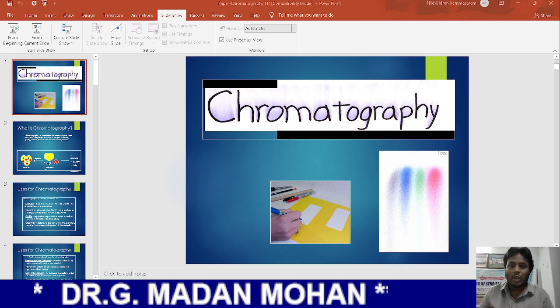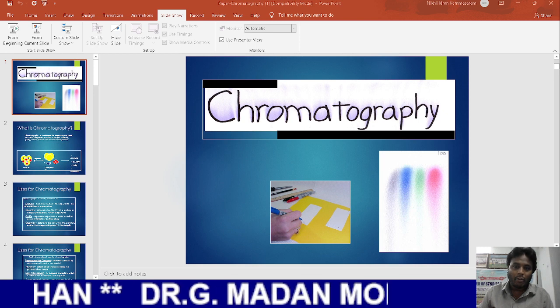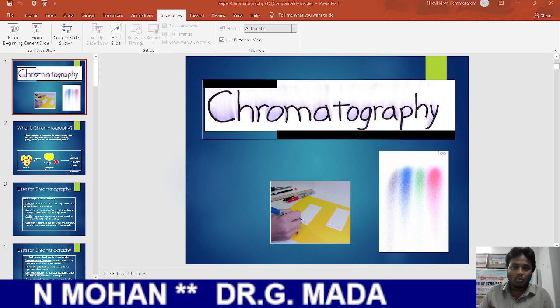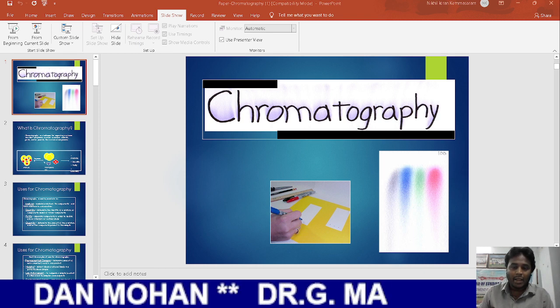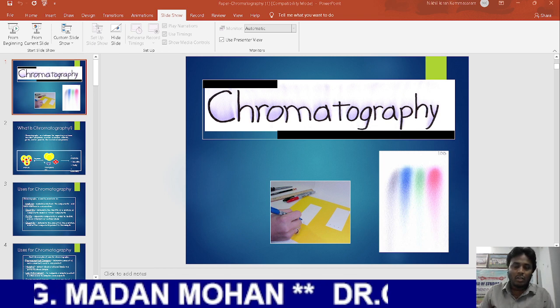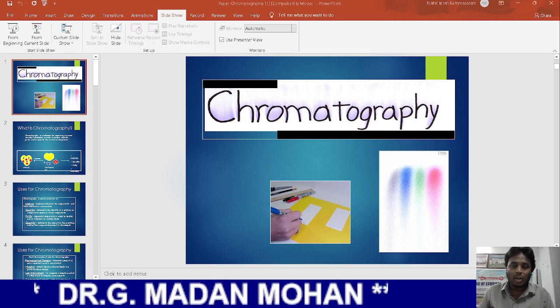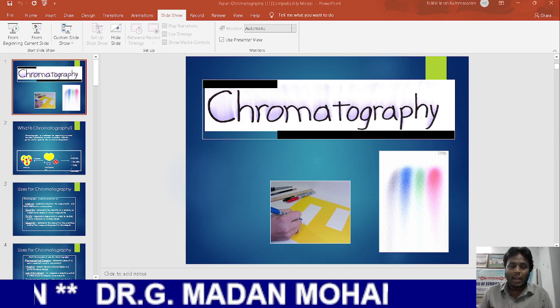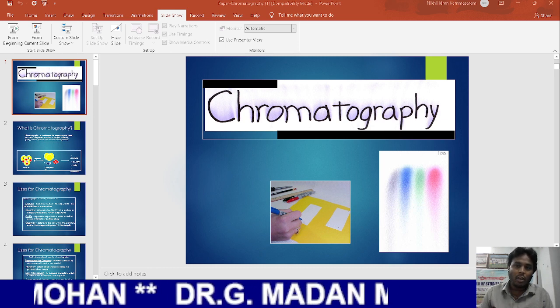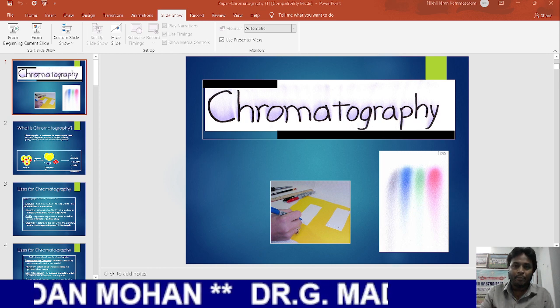Hello viewers, today we are going to discuss a topic, chromatography. It is a topic from biophysics. It is a common topic for various students who are studying BSc biological sciences, MSc life sciences, chemistry. Chromatography is a very useful technique, and in today's session we are going to discuss various aspects of chromatography, like principle of chromatography, instrumentation of chromatography, types of chromatography and applications of chromatography. All these we are going to discuss in today's session.